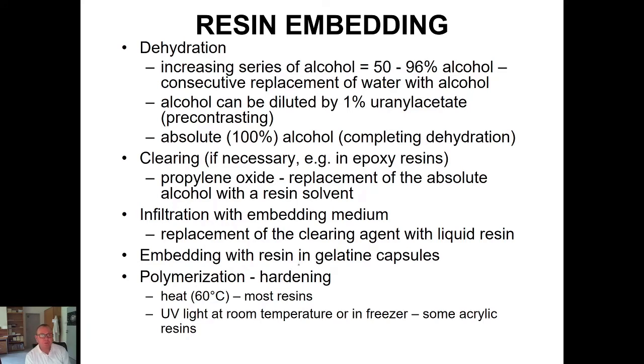If we use acrylic resins, this dehydration needn't be complete. So in these techniques we don't use absolute alcohol. During dehydration we can use a solution of uranyl acetate instead of water. Why should we do it?